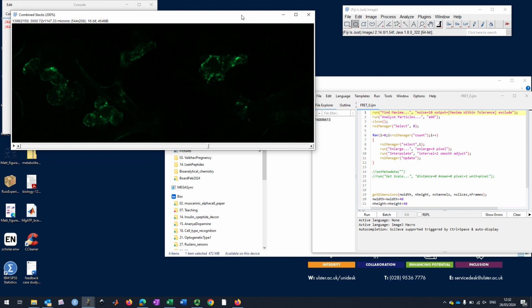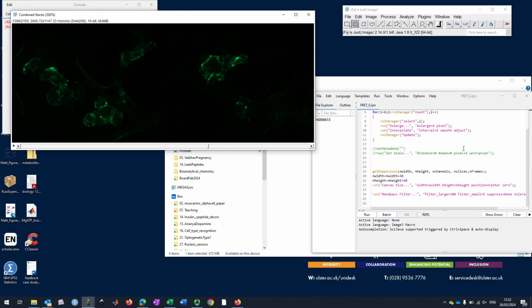I'll take this image, which has green stuff, and around the image I will make a black border, a little black border, just in case one of the bright objects touches the current borders, because the correction does not work very well when your objects touch the borders. I will ensure that all the objects are enclosed in the borders.